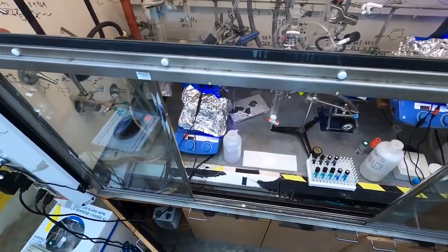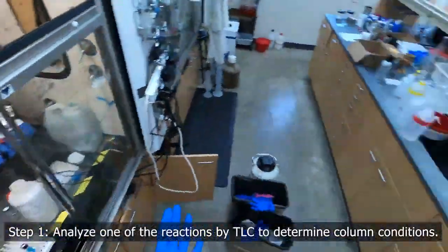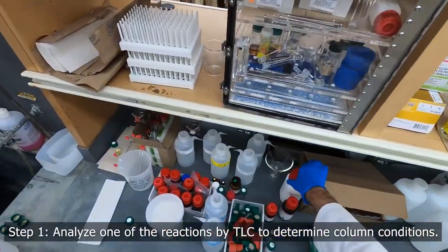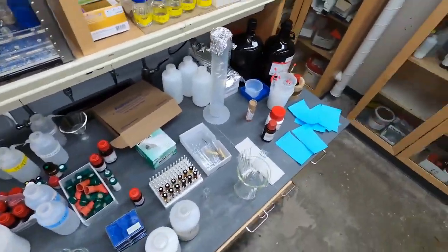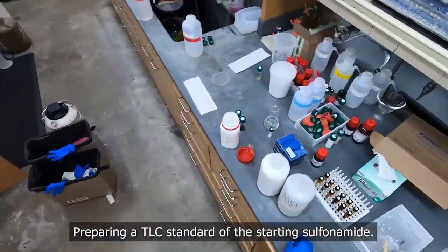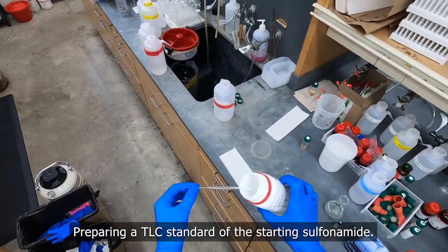And now we're going to do a TLC analysis to see what kind of column condition is going to work for this reaction. So what we need is a standard of the product, or of one of the starting materials rather, which I've got right here. And we can put this just a little bit into a vial. You only need a teeny bit here.